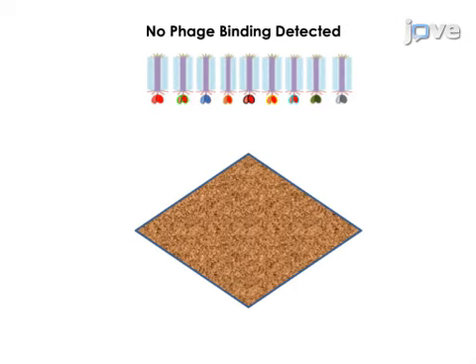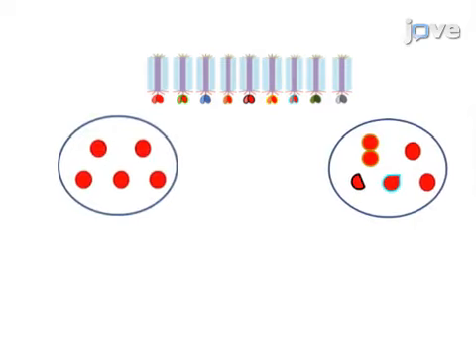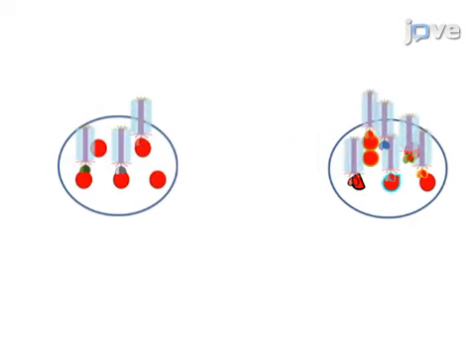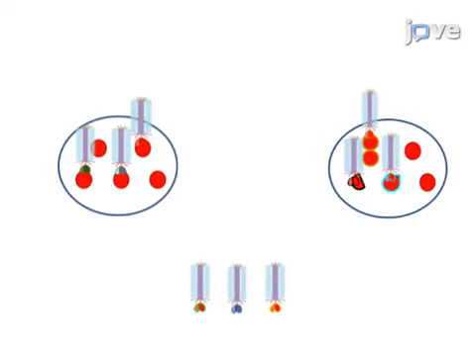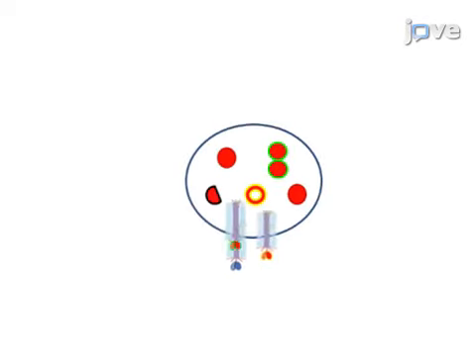the 10th round. Next, the remaining negative panning rounds are performed on mica due to limited sample availability. Phages reactive to immunoprecipitated TDP-43 from healthy and from frontotemporal dementia, or FTD, tissue are removed sequentially. The final step is to isolate the phages that bind to the ALS immunoprecipitated TDP-43 using mica.